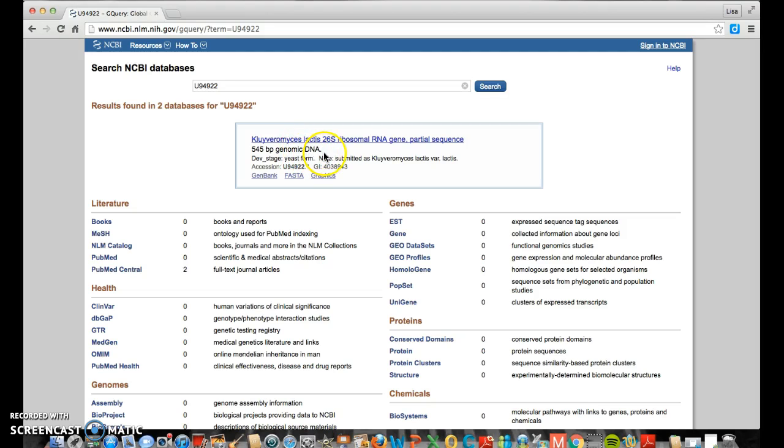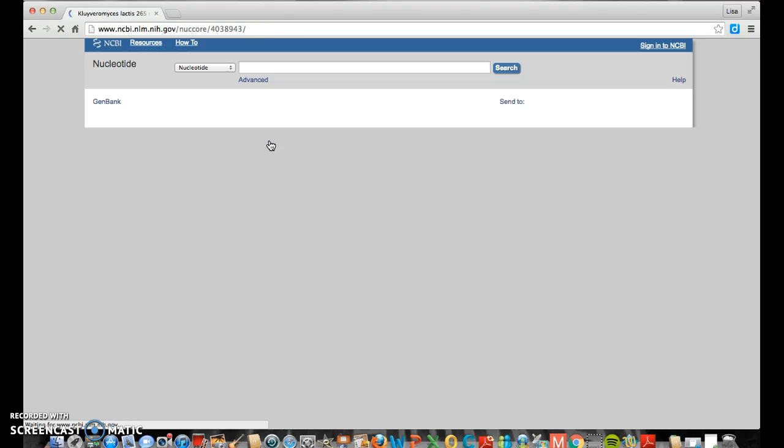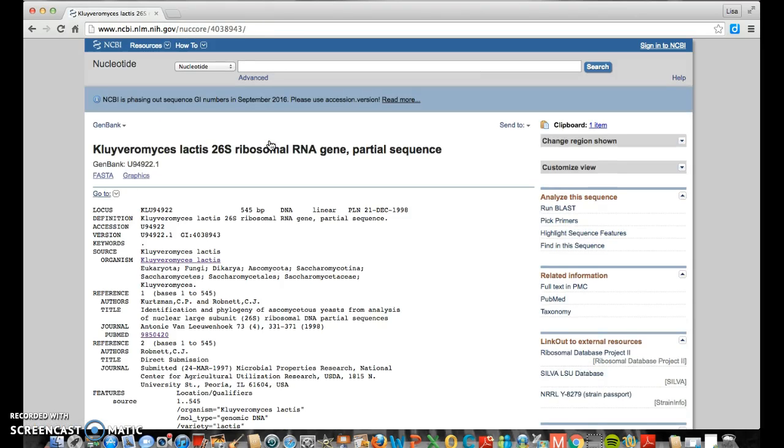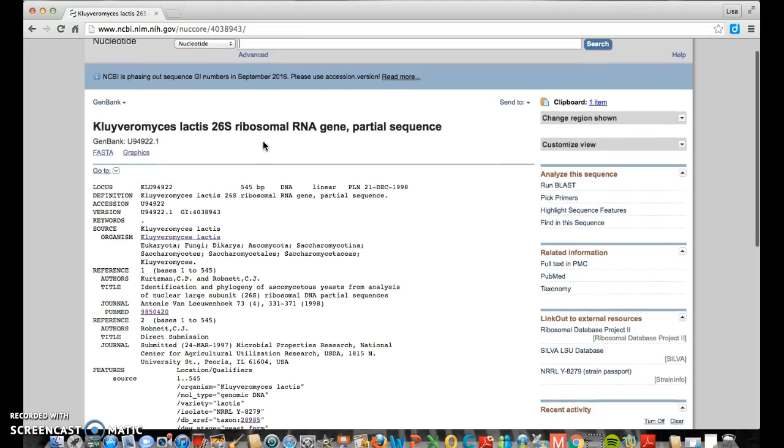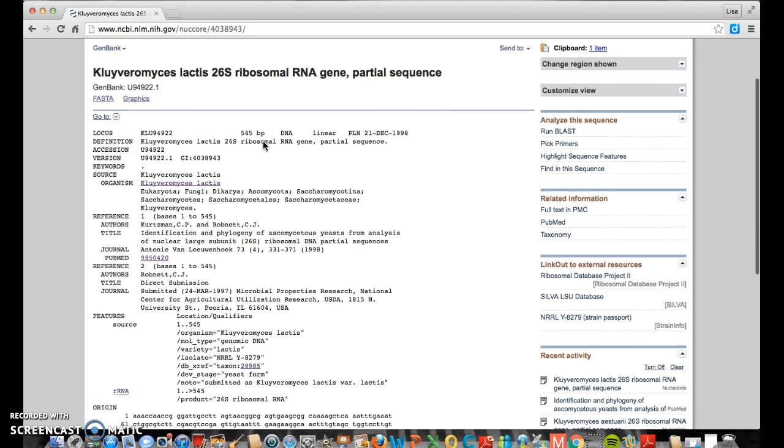Kluyveromyces lactis, 26S ribosomal RNA gene, a partial sequence. That's a mouthful. The neat thing is you're going to find out that this is the name of the species, Kluyveromyces lactis. And from now on, we're going to call it a little shortcut name. We're going to call it K-lactis. So I'm going to select this link. And I can find out more information about this particular species.